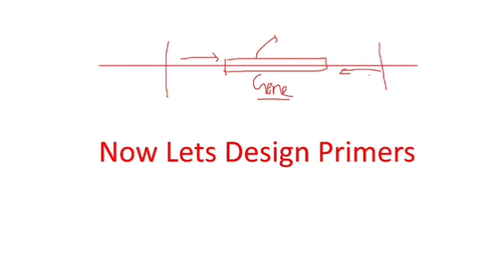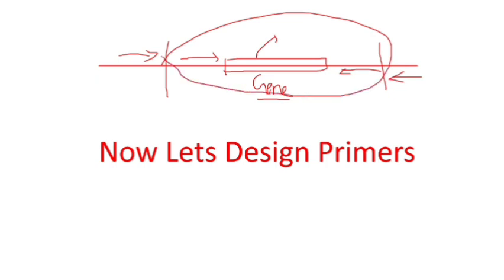But actually, to properly design the primer, it should be designed in the flanking region, the nearby region of the gene, so that the full gene gets amplified by the PCR.